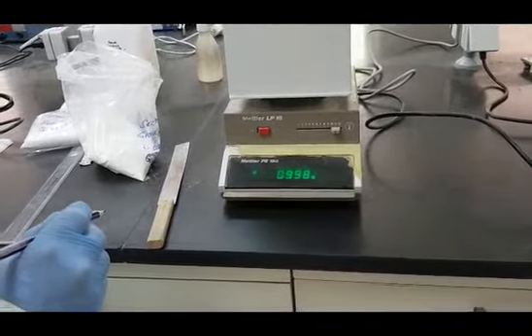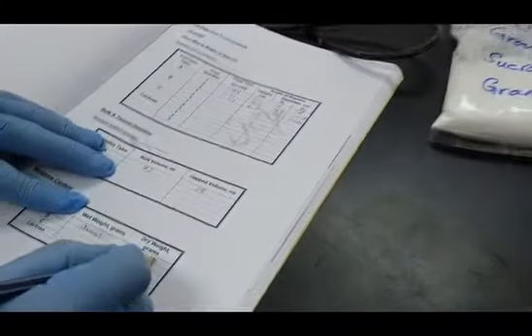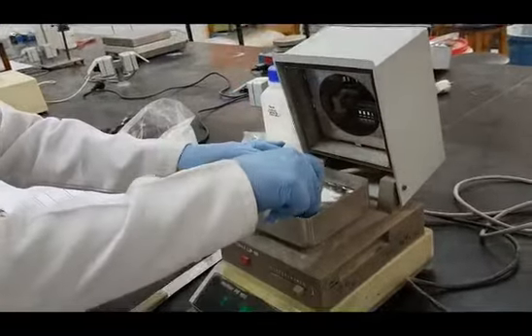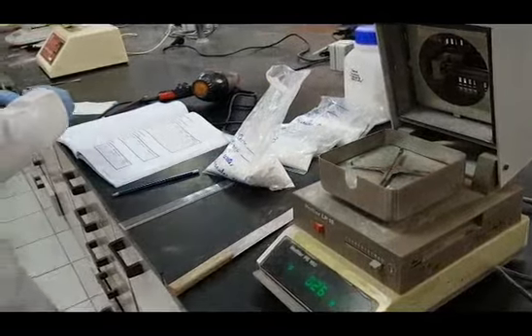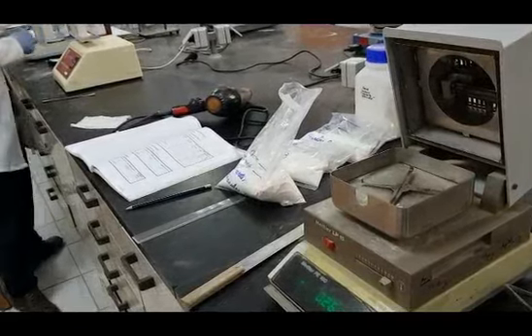When you reach a number on your balance display, and this number increases to the number before it, then decreases to the same number, this will be the final completely dried particles weight.